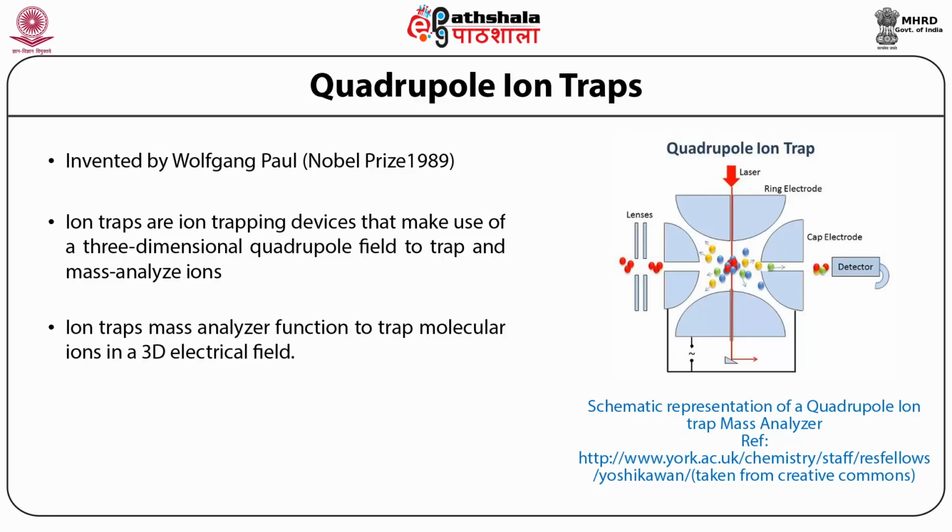The ions enter the cavity between the electrodes through one of the end caps, and there the electric field causes the ions of a certain M/Z value to orbit in the space. On increasing the radio frequency voltage, heavier mass ion orbits become more stabilized, while light mass ions become less stabilized and collide with the wall, and therefore are not detected by the detector.